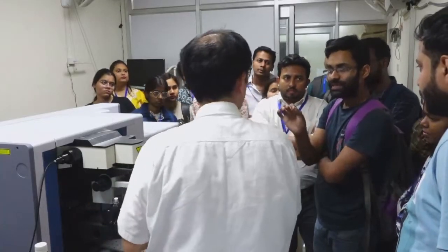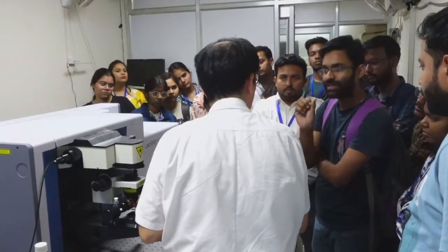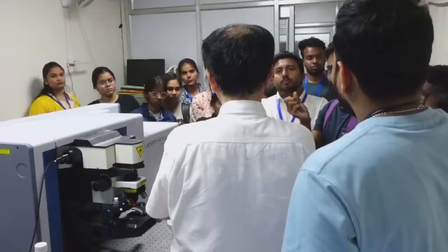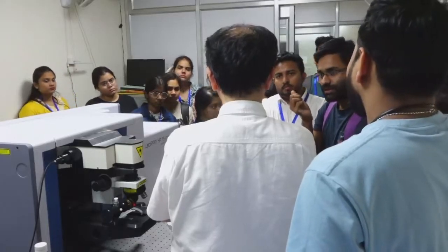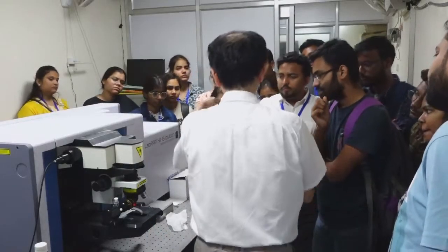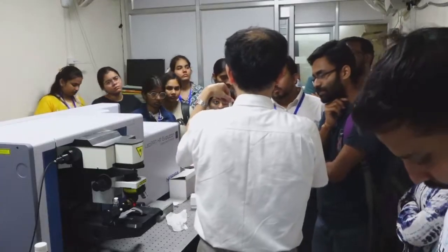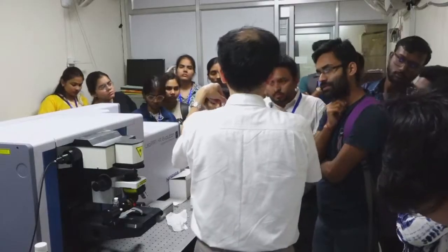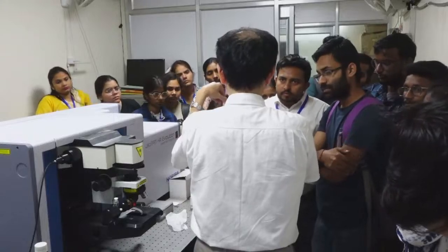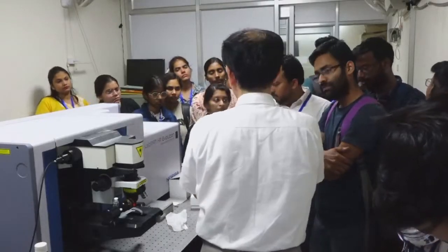So how do we prepare the sample? If there is a solid or gaseous material, how would we prepare the sample? Generally speaking, in this case, we dissolve the sugar in the water, and this is the sample. One important point is that we need to use pure material. The biggest problem is fluorescence. If there is impurity, it gives fluorescence and makes the quality of the data lower.